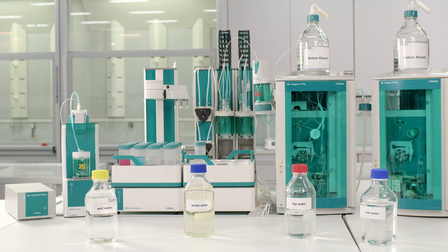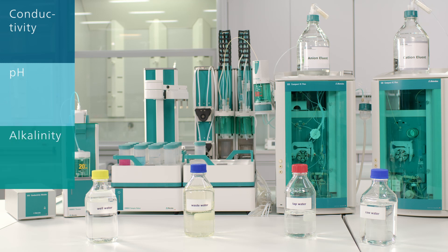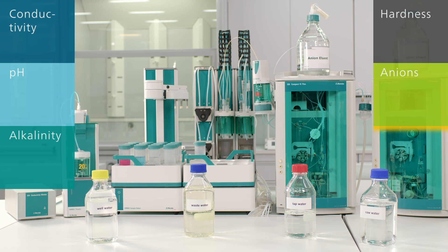With TITRIC you can determine water quality parameters like conductivity, pH, alkalinity, hardness, anions and cations out of one sample beaker.